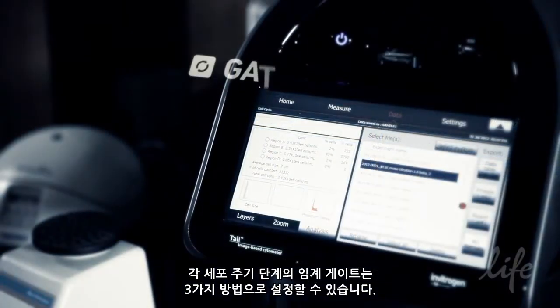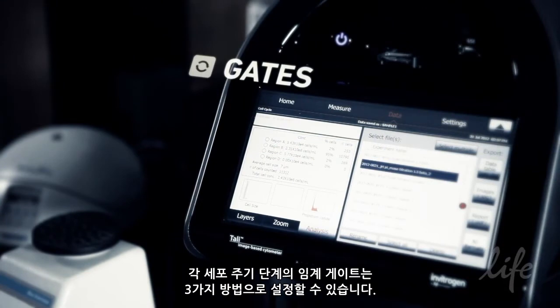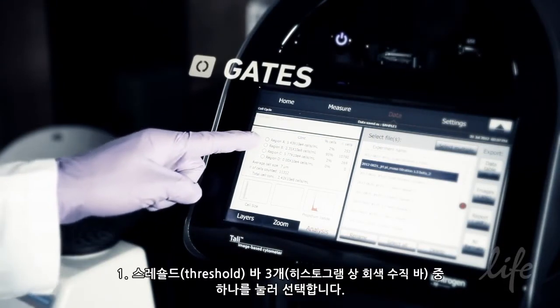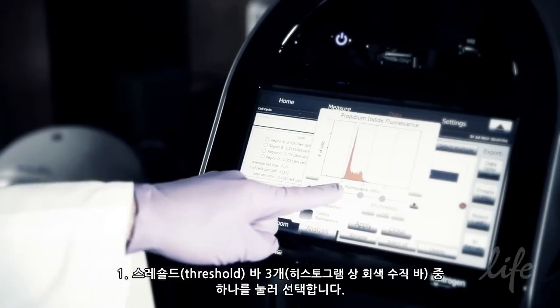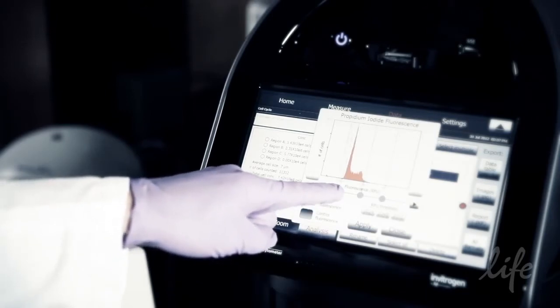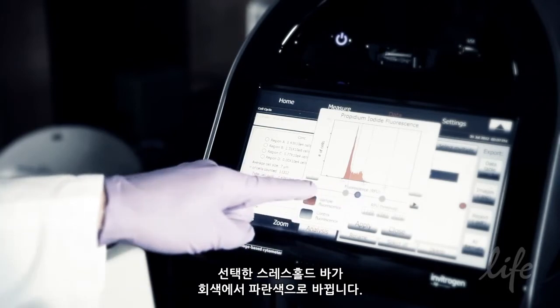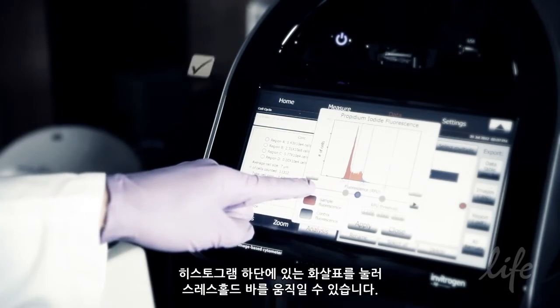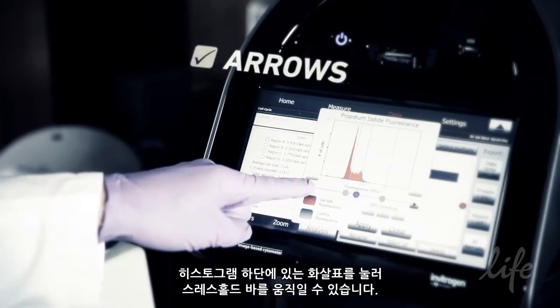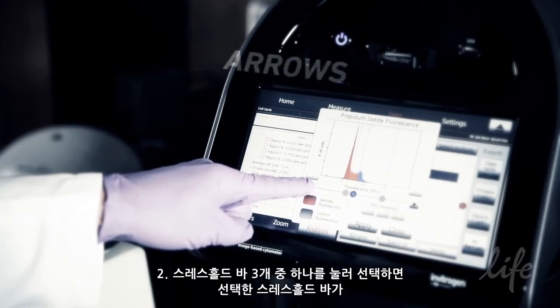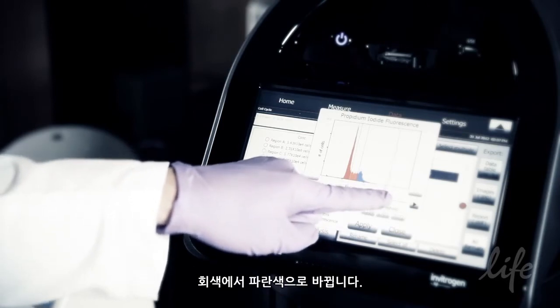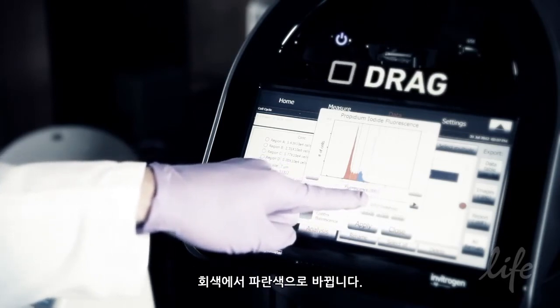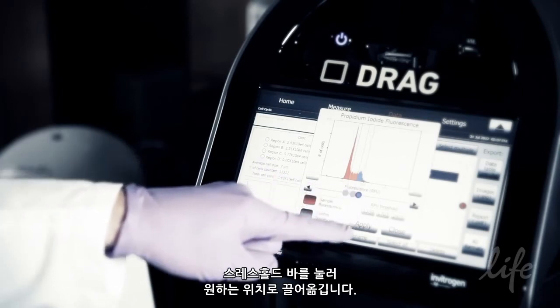The threshold gates for each cell cycle phase can be set in three ways. Method 1: Tap to select one of the three threshold bars — the grey vertical bars on the histogram. The selected threshold bar will turn from grey to blue. Tap on arrows at the bottom of the histogram to move the threshold bar. Method 2: Tap to select one of the three threshold bars; the selected bar will turn from grey to blue, then drag the threshold bar to the desired location.